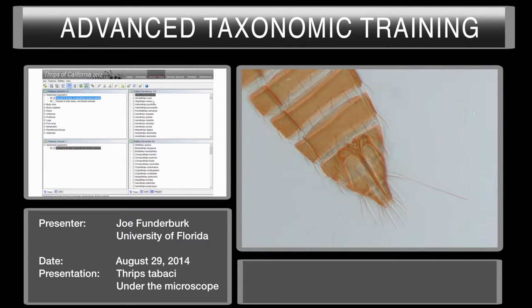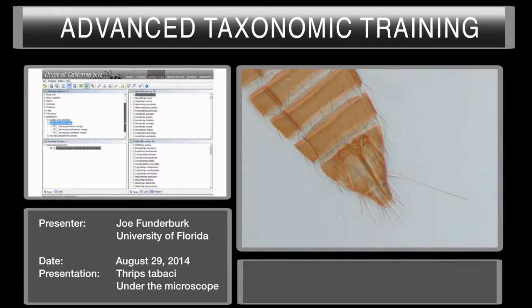We have 173 species remaining. I'm going to proceed with the next best character. It has gone to the metanotum — specifically the metanotal median setae.